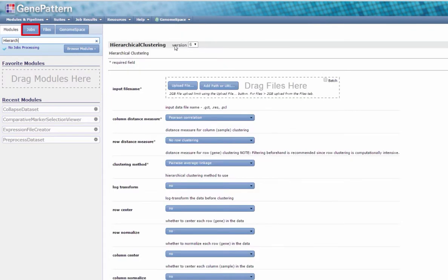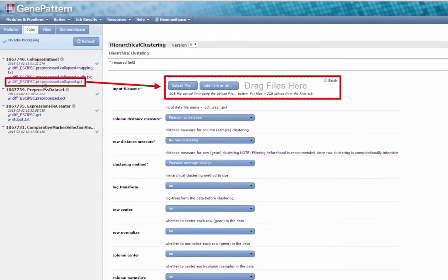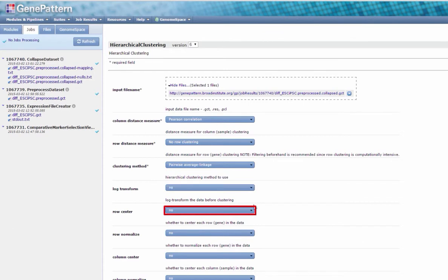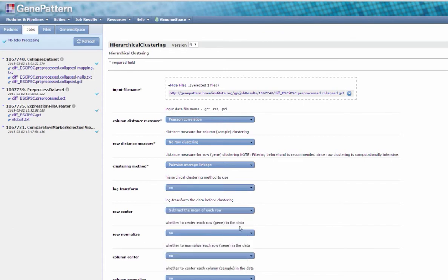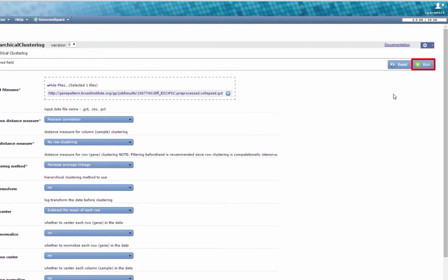Under the Jobs tab, click and drag the output from your previous job, diff-esc-ipsc.preprocessed.collapse.gct, to the Input File Name field. Set the Row Center parameter to subtract the mean of each row. Click Run and wait for your job to finish.